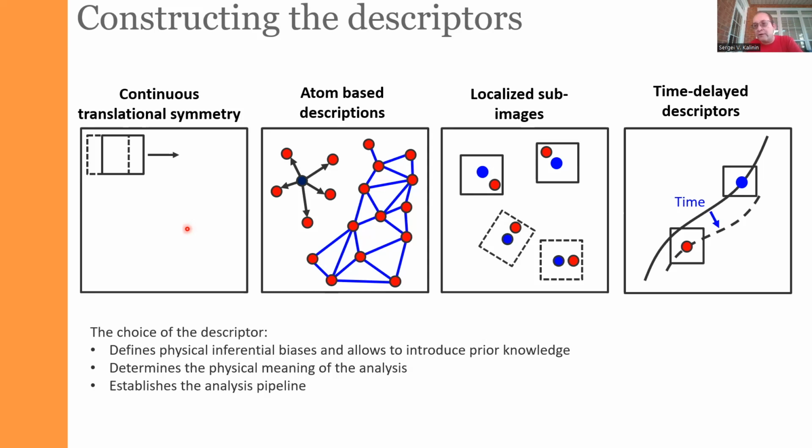And this brings me to the second type of descriptors we can select, which are the descriptors based on the determined atomic positions. If we use the same approach that Gerd showed in the previous lecture, we can find the positions of all the atoms in the system, and then analyze the system structure one atom at a time.